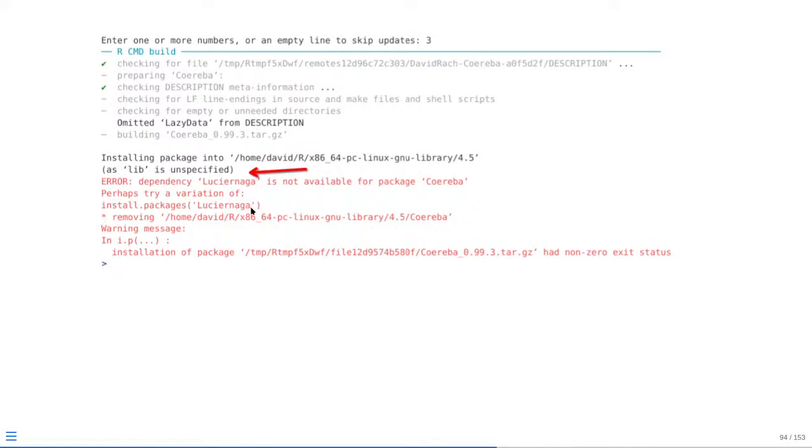So if you try to just copy and paste this help suggestion, it's not going to quite work. But at least once you've located where in this location it is as far as the error message, you can get a little bit more context cues about how to go about trying to troubleshoot it. One good thing that you can do is copy and paste this particular portion of the error message and put it into your web search and see what comes up.